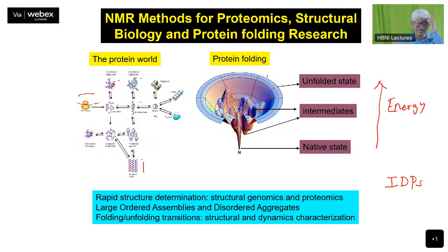But you need to understand what sort of ensemble average happens, what sort of elements are present in this ensemble. We need to characterize all of those things. This you can do when you do your experiments as a function of time, the kinetic experiments. So you see, our research problems are very well described on this slide.